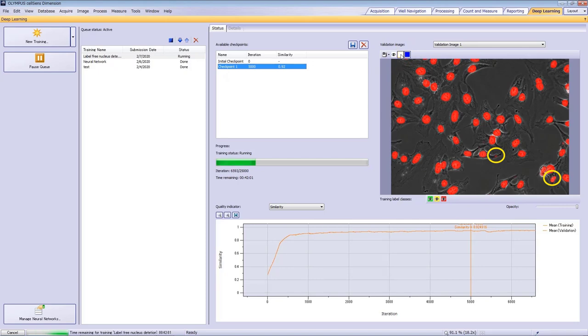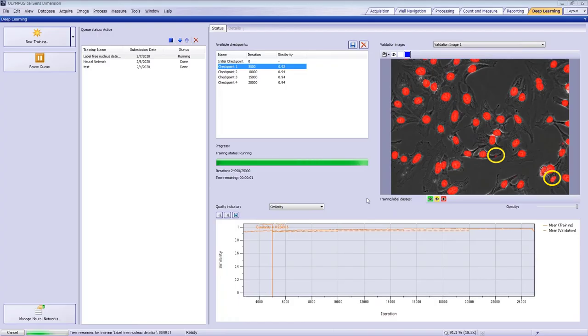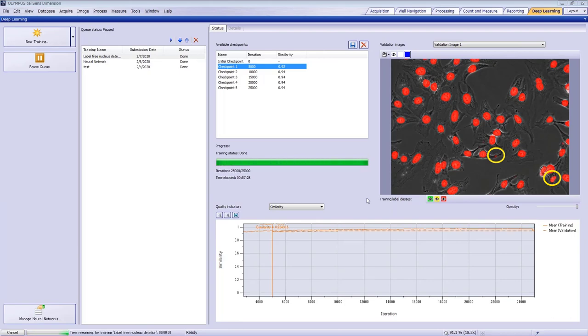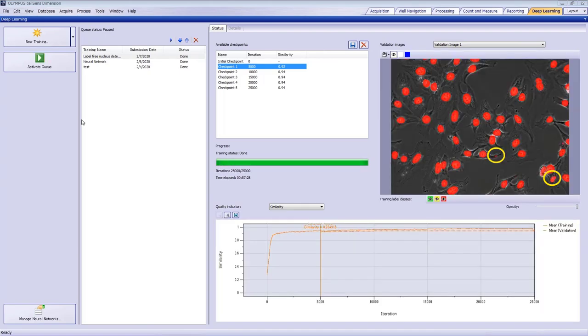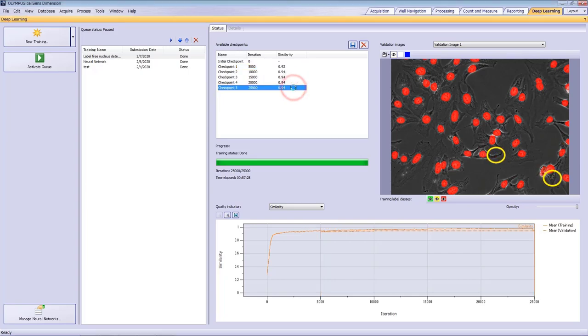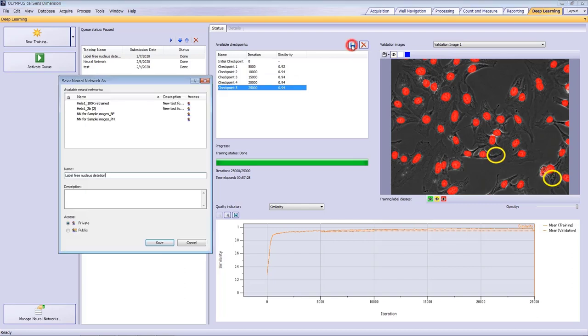In this example, the training process is finished after five checkpoints have been created. Now that the training is complete, we can see that the detection is very accurate, and the errors we saw at the first checkpoint are gone. Save the neural network at checkpoint 5 so that we can use it for other images.